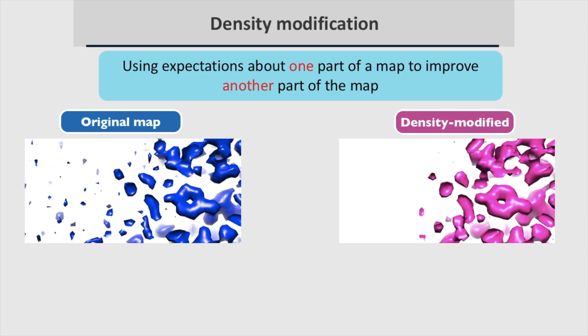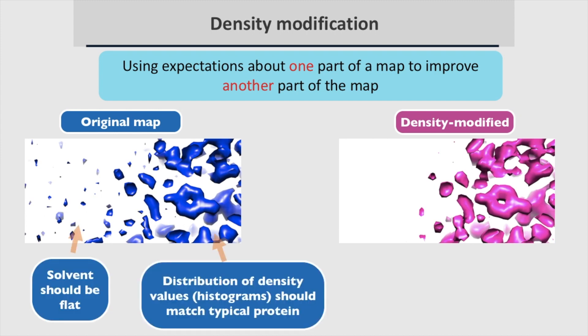The original map on the left is implausible. It has a noisy solvent and its density profile is unlike that of typical protein because it contains noise. The density modified map on the right is more plausible with flat solvent and density histograms similar to those of typical proteins.